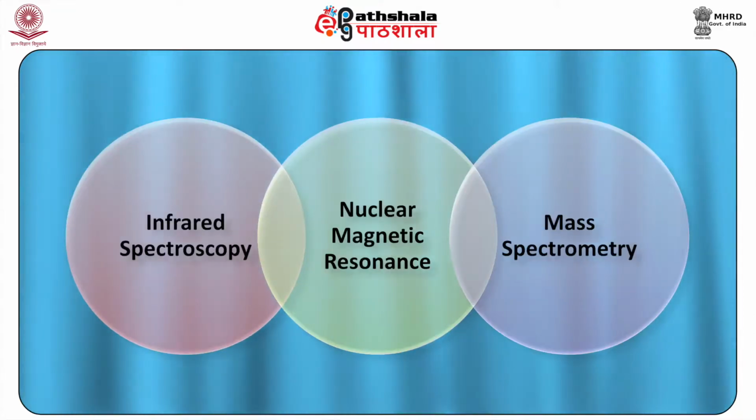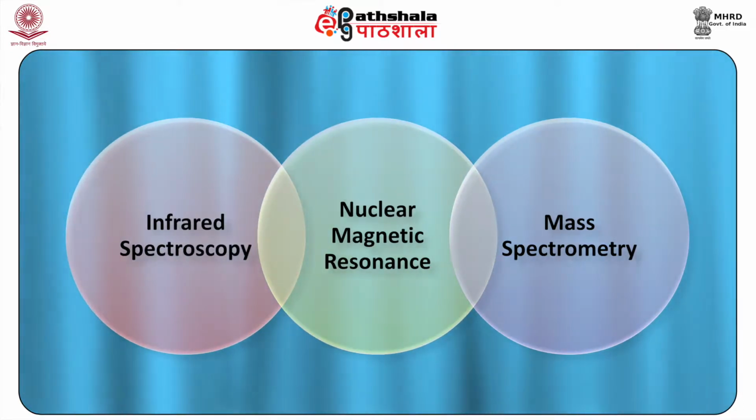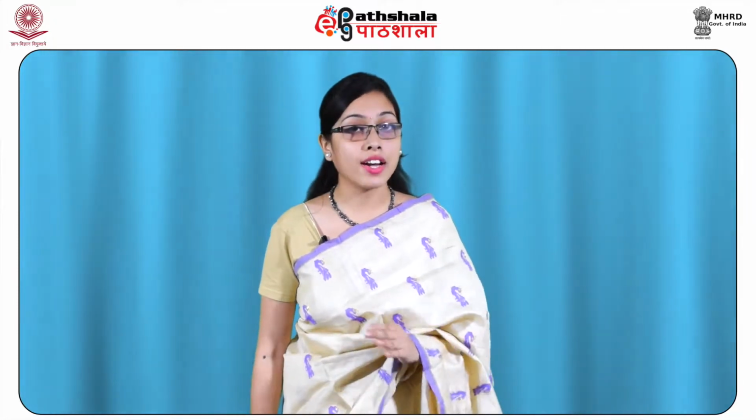However, final identification usually requires confirmation by some other analytical procedure such as infrared or IR spectroscopy, nuclear magnetic resonance or NMR spectroscopy, or mass spectroscopy or MS. Quantitative analysis can be carried out by measuring the area of the chromatographic peak. Hence, chromatography can be used for qualitative and quantitative analysis.